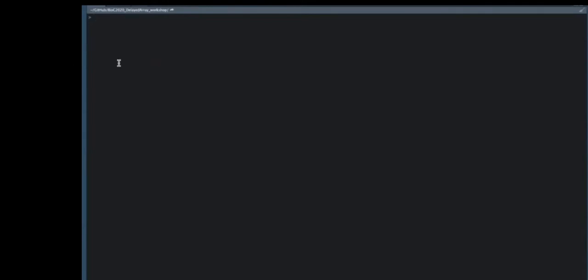Let's add 1 to every entry in the 10x subset. Let's look at the tree of delayed operations on this object using the showTree function. We see that in addition to the subset operation, we now have delayed this operation called a unary ISO op, which we'll explain in a moment. But it basically corresponds to adding 1 to every element of our dataset.